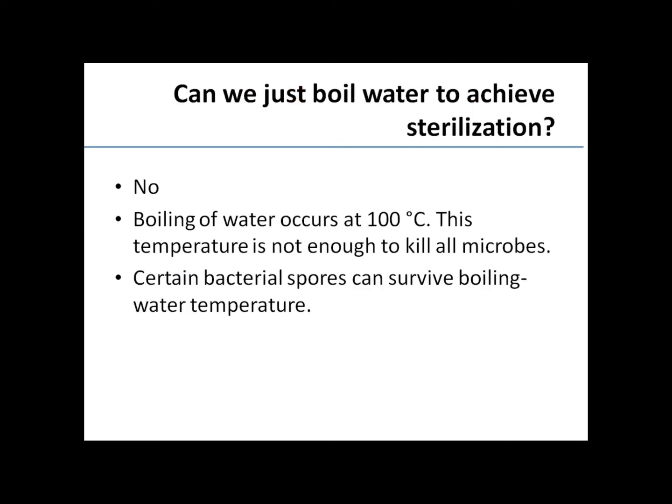Now coming to a question that many students have in their minds. They believe that boiling of water can achieve sterilization. Can we just boil water to achieve sterilization? In one word, the answer is no. Because boiling of water occurs at 100 degrees Celsius. This temperature is not enough to kill all microbes.